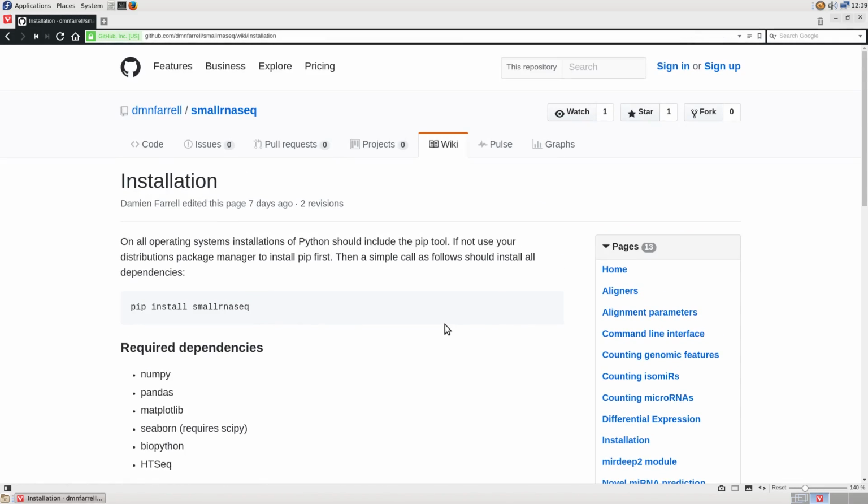And just to say about the installation, this software is designed to be run on Linux, and in the video, the operating system I've used is Linux. But even if you are a Windows user and you're not familiar with using Linux, it really is fairly straightforward now to install a program called VirtualBox, or another virtual machine tool that allows you to run Linux inside your Windows operating system. So I'd encourage people to try that. It really isn't that hard.